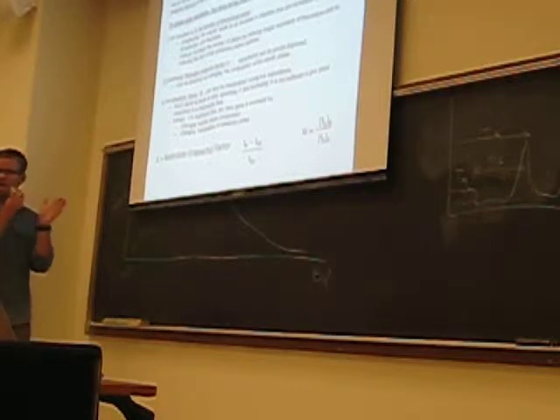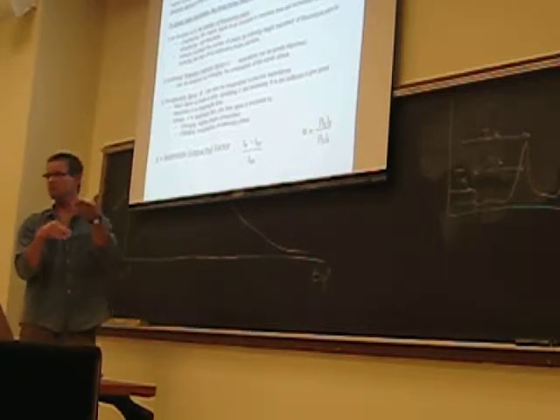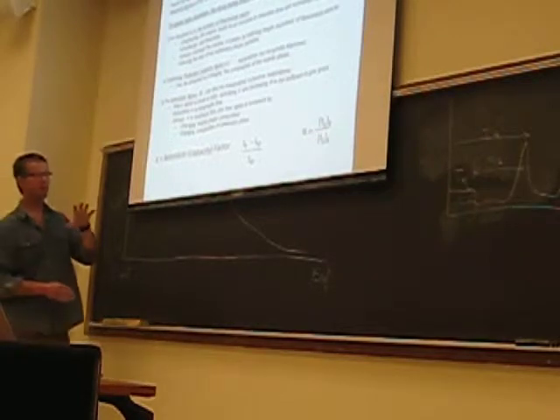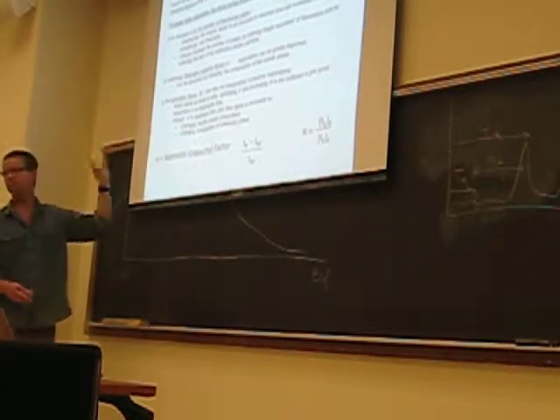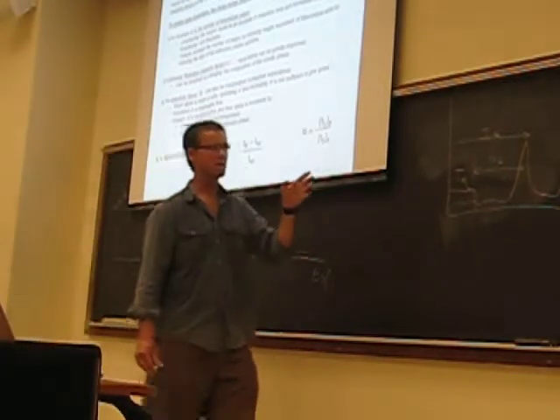So changing how fast you're pumping the mobile phase through the column isn't going to buy you anything other than having things move out more quickly. It's not going to change the resolution. The only way you can modify that to optimize it is by modifying the composition and chemistry of the mobile phase or the properties of the column.